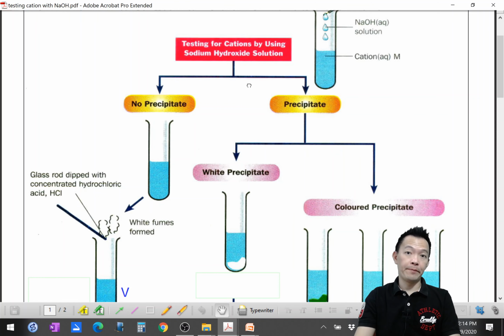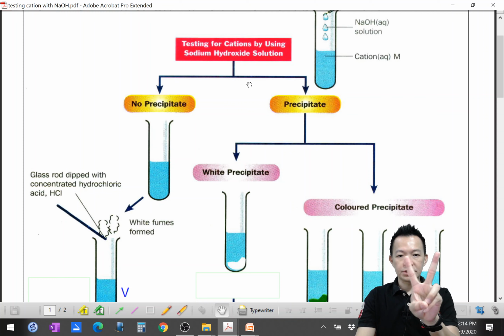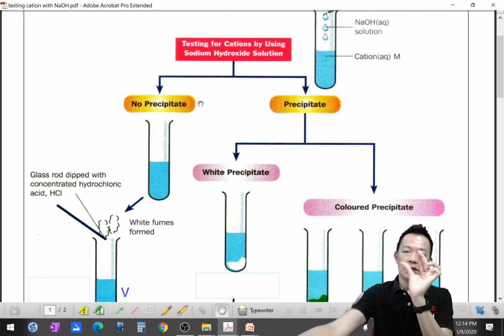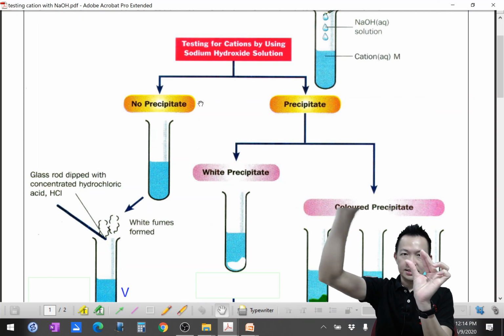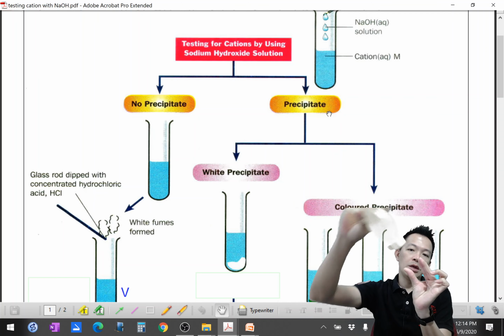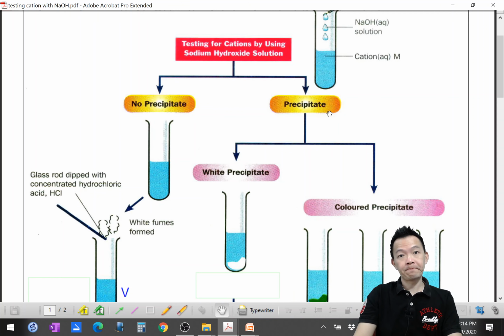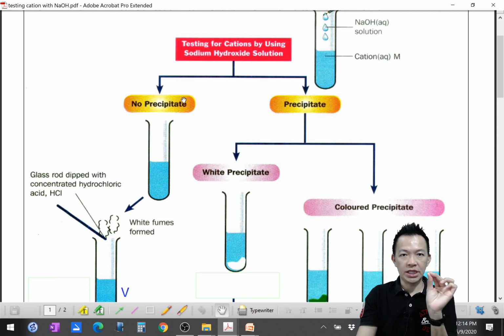Okay, so after I add the sodium hydroxide, you can have two observations: no precipitate and with precipitate. No precipitate, that means you see nothing. They are colorless. After you add the sodium hydroxide, you can see nothing. This is what we call no precipitate. No solid comes out. Another group, another observation, will be with precipitate. You will see some precipitate, some colored powder coming out. Okay? So now, salt solution, add with the sodium hydroxide, no precipitate will be formed.